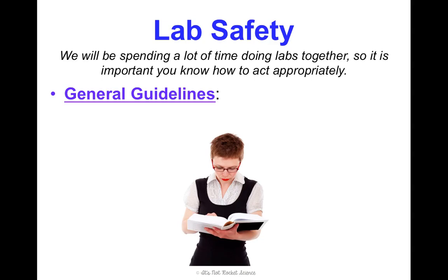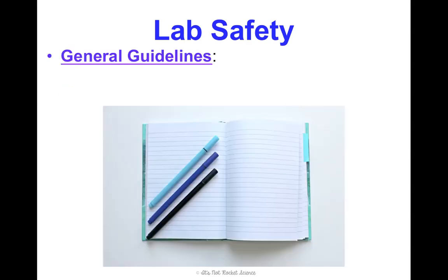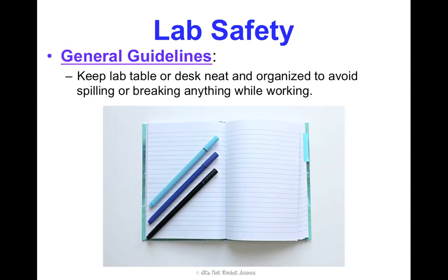A couple of general guidelines to get started. Always read the lab through in its entirety before doing anything else. It's so important that you have an idea of what you're doing before you get started, so you can ask any questions before getting in the middle of things. Also, always keep your lab table or desk wherever you're working neat and organized. Most of the time when people end up spilling or breaking something is because they accidentally bumped their binder or notebook and knocked something over.